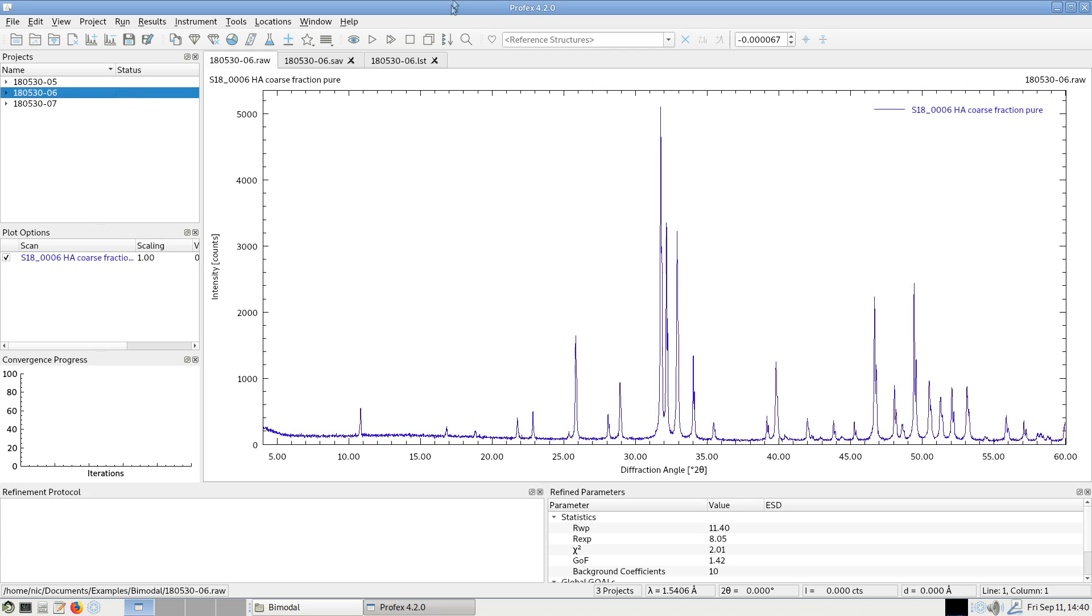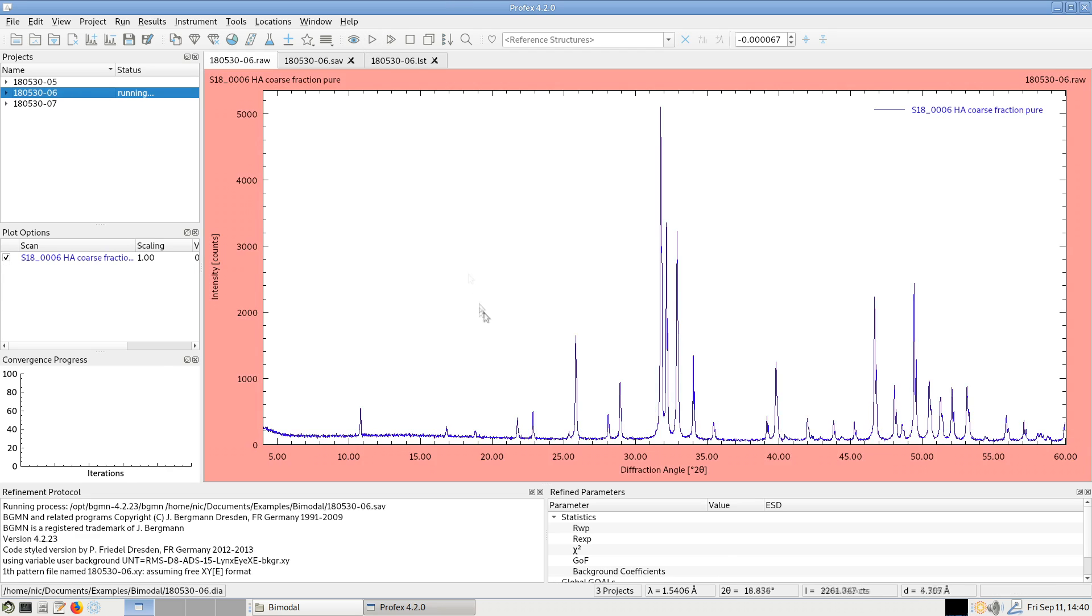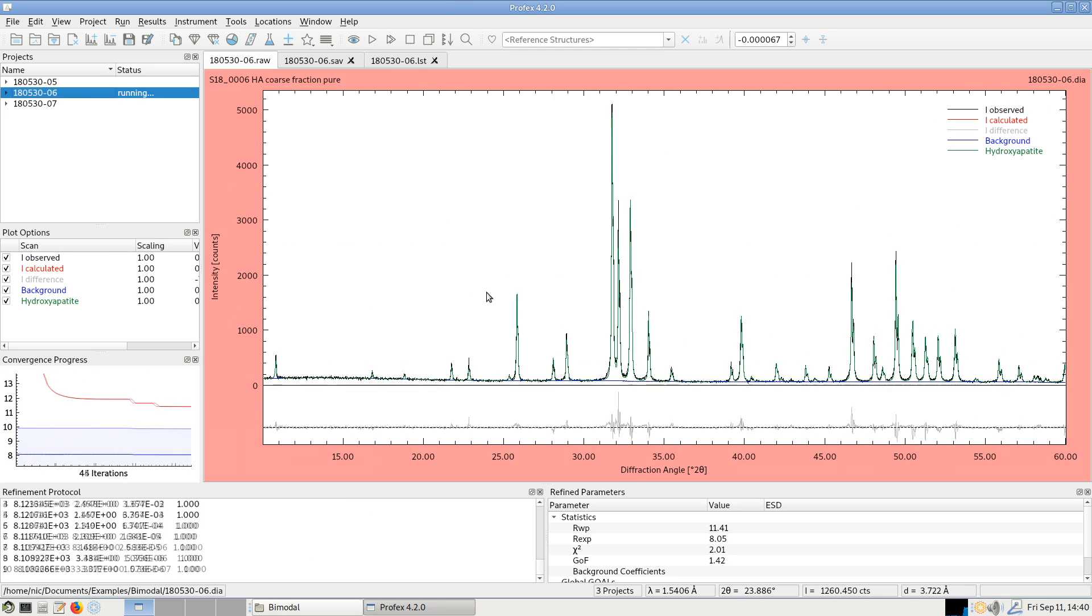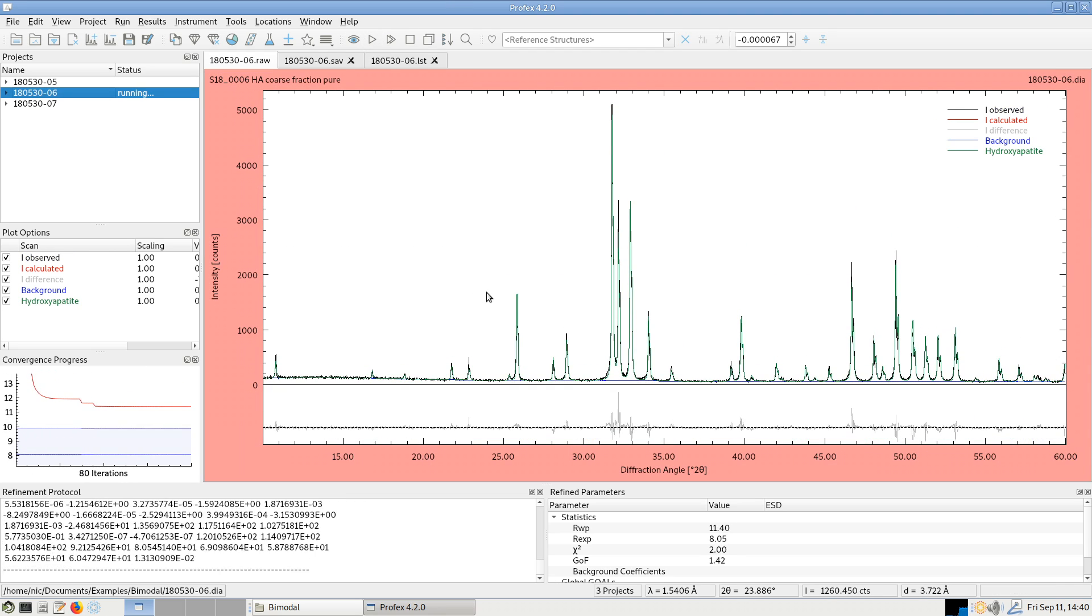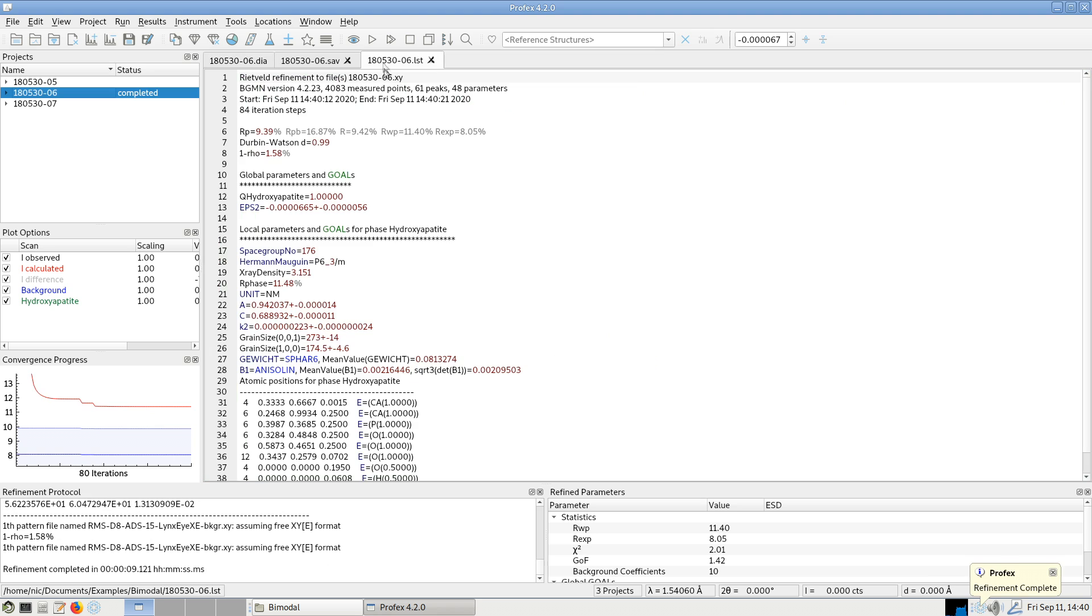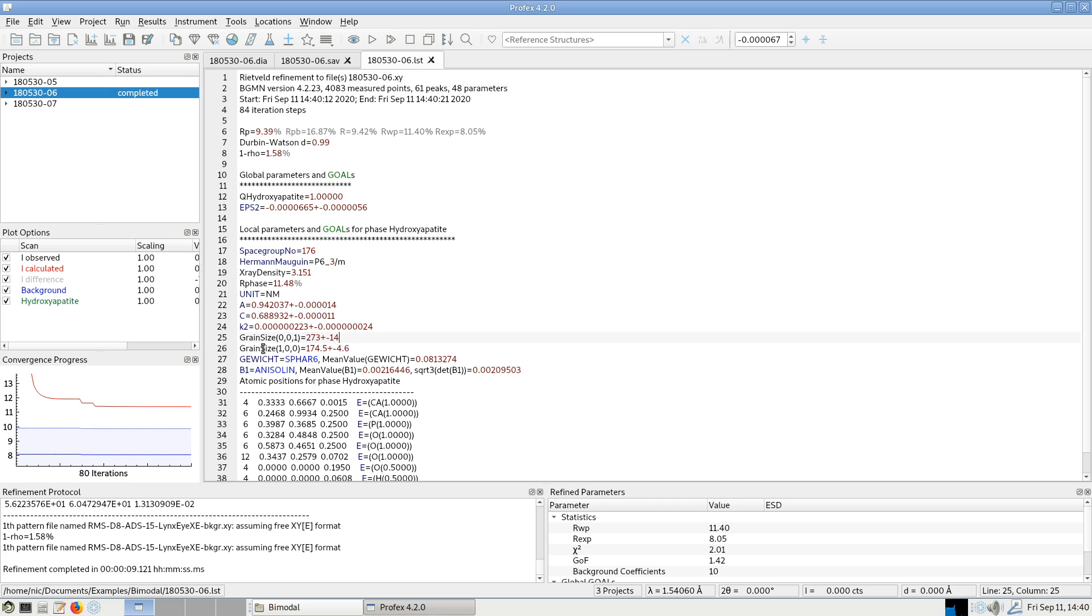for example the highly crystalline one. It results in a grain size along the C axis in direction 001 of 273 nanometers and along the A axis of 174.5 nanometers.